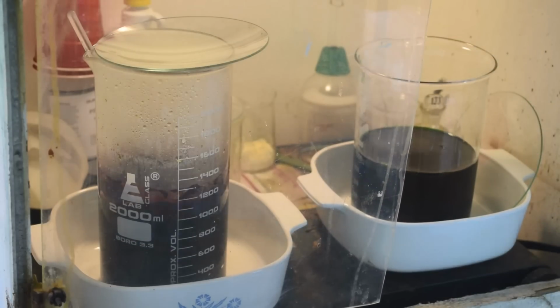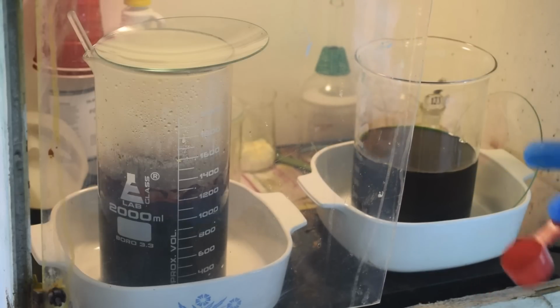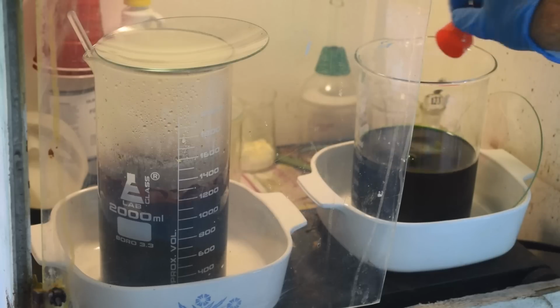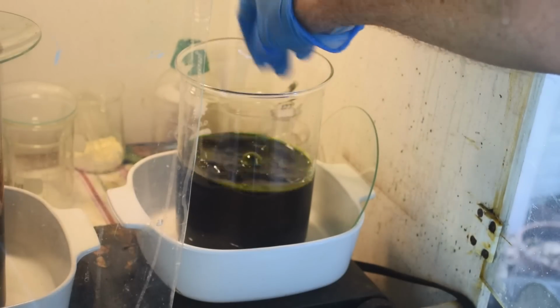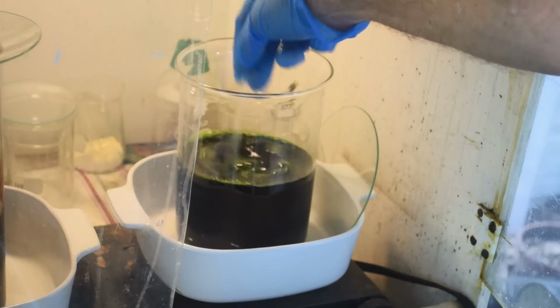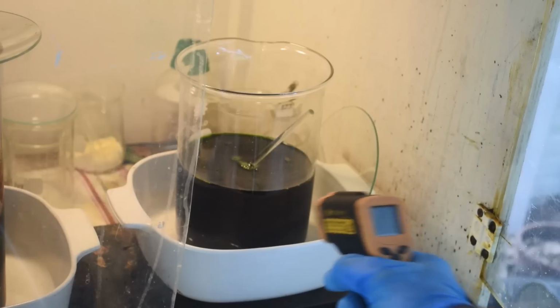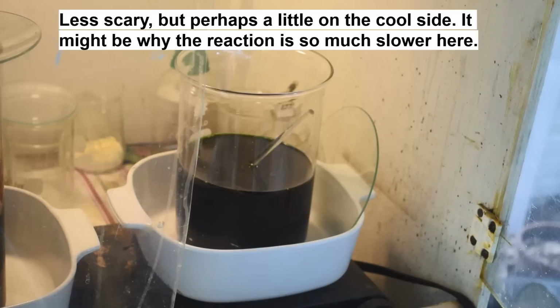I'm not too worried about having a slight excess of ammonium chloride in here. Like if there's a few grains in the bottom that won't dissolve, that's fine. Because in a later step, it'll just get sublimated away in an oven. So not really a big deal. So, all right, let me get some more in here and get it dissolved. Let's see where we are with this stuff. I see a couple undissolved grains swirling by, so I would say it's got as much as it's going to take. 52°C, that's a less scary temperature for doing this reaction. I think we're ready to go.